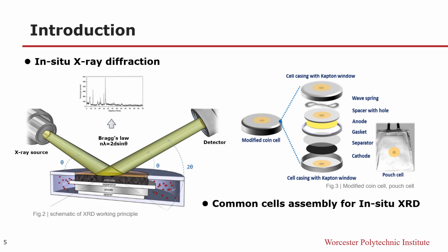In-situ refers to the analysis in a specific site of the sample within the native environment of the battery, which means it can help us record the composition and structural transformation during the cycling process in a sealed battery cell. Without opening and disassembling process, this greatly reduces the risk of contamination or relaxation of metastable species. Thus, the data collected is much more accurate and close to real conditions.